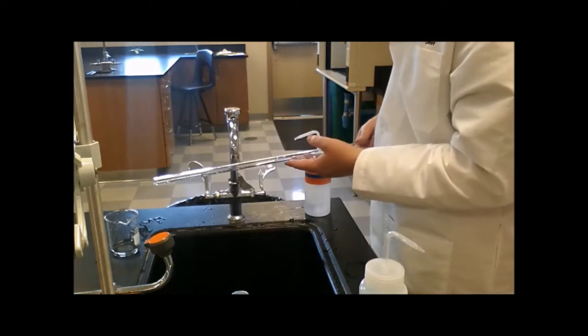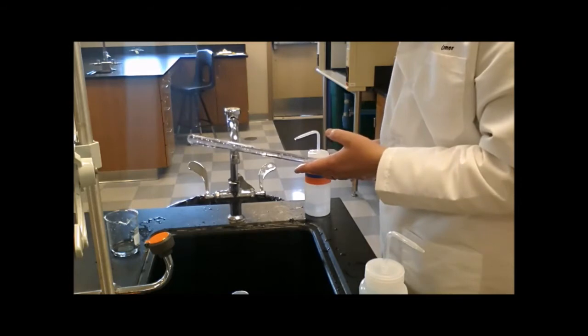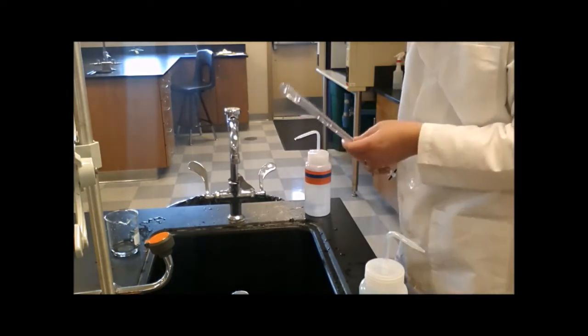Except what's in here now is not what you want it to be. It's actually deionized water, and we're not going to put deionized water in it. We're going to put, generally, sodium hydroxide. So now the burette's full of distilled water. We don't want it full of distilled water. Generally, we're going to put the sodium hydroxide in the burette.